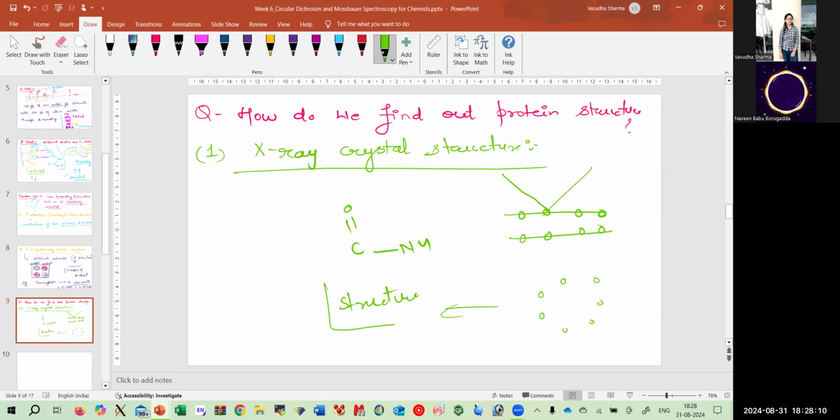But in this particular situation, we need to know that it is very difficult to identify the protein structure using X-ray, because the side chains would be randomly oriented. And if we say that random coils don't really have a structure, they are so flexible they can move at any point of time, and we won't have the X-ray structure. Also, proteins do change their structures.